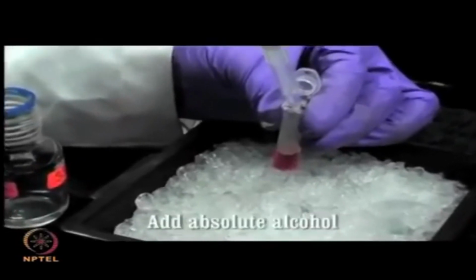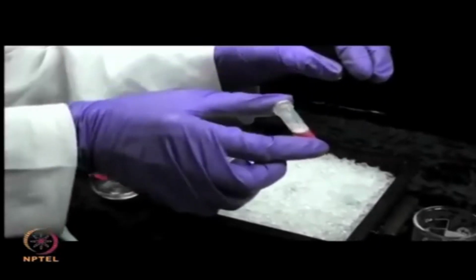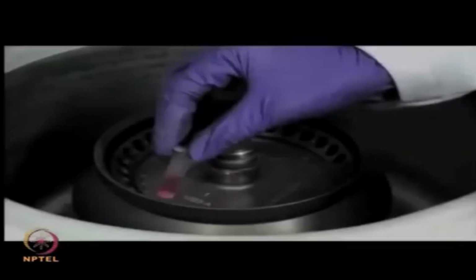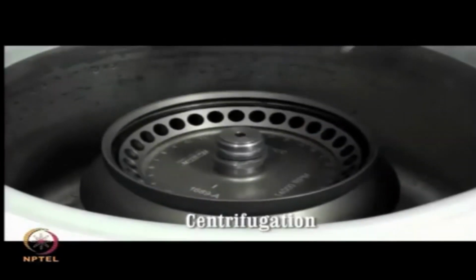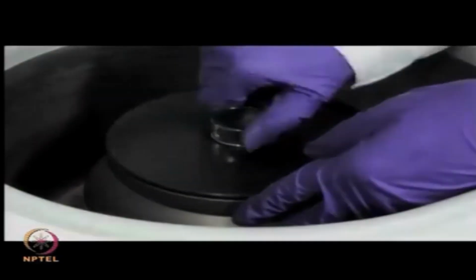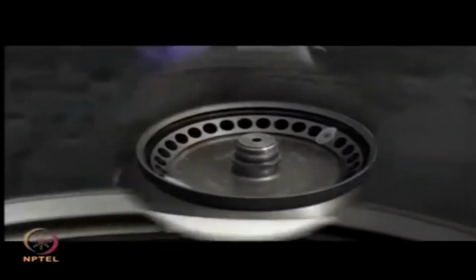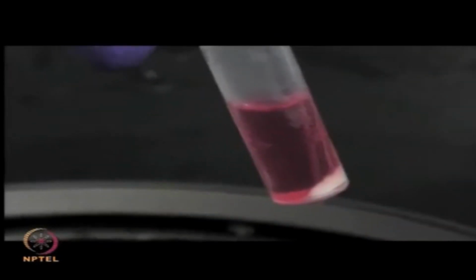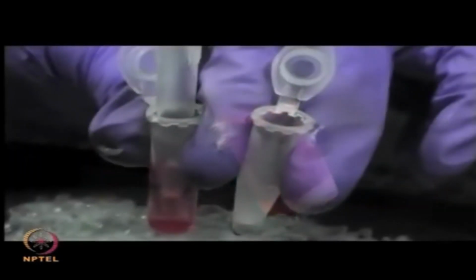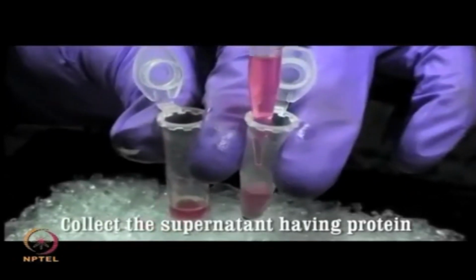Then add absolute alcohol to the remaining layers and mix the solution well. Centrifuge the contents at 2000 rpm for 5 minutes. The DNA forms a white precipitate at the bottom of the tube while the proteins remain in the clear supernatant. Collect the supernatant in a fresh tube.